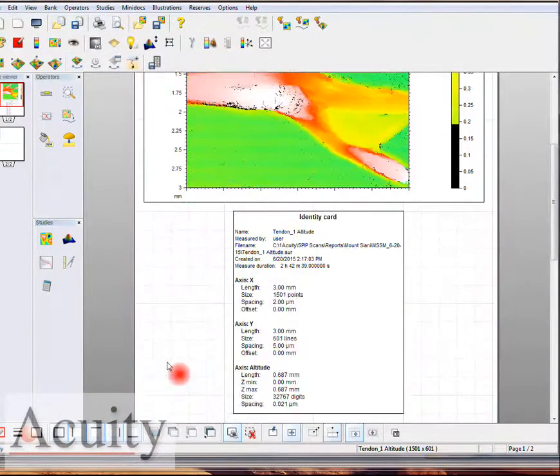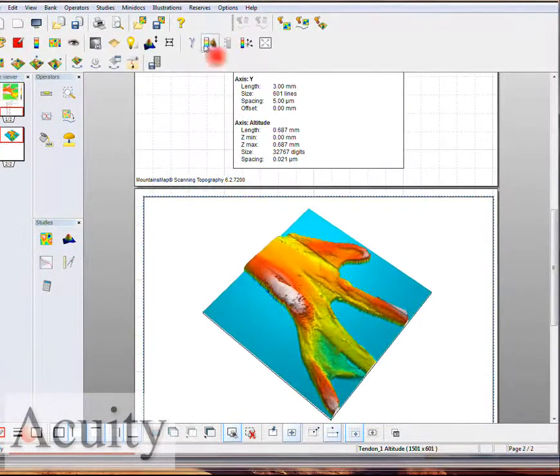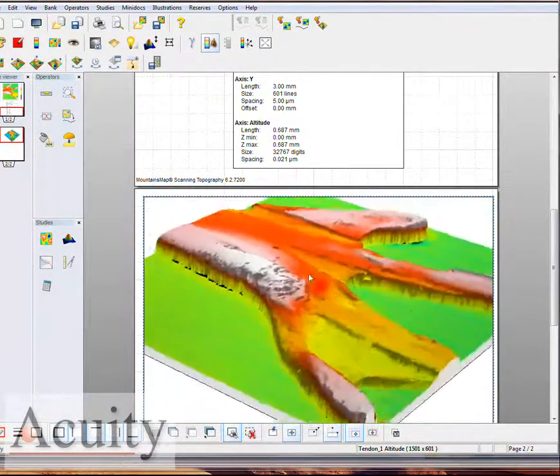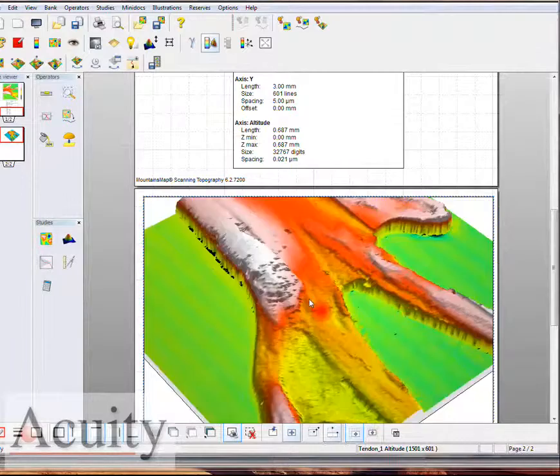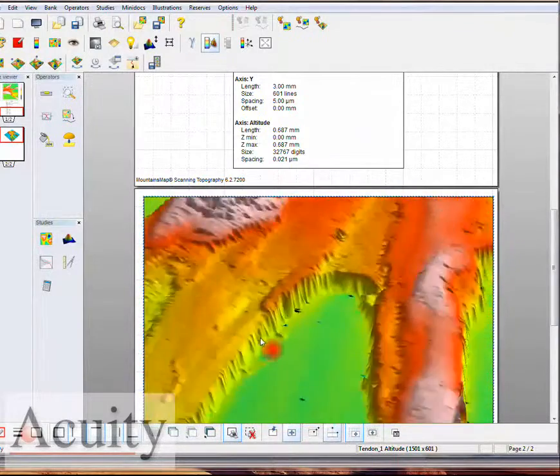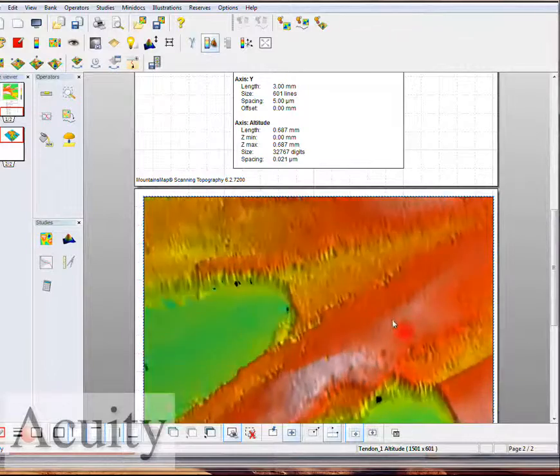This is what that target is going to look like in 3D. Here where we thought we saw some of the target drying out, but as you can see we are getting really good resolution and data of the surface.